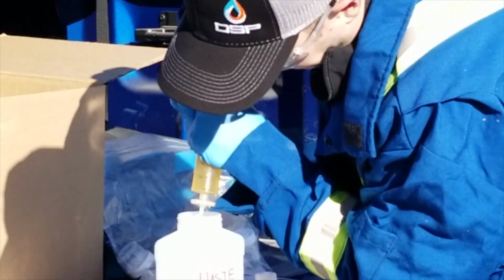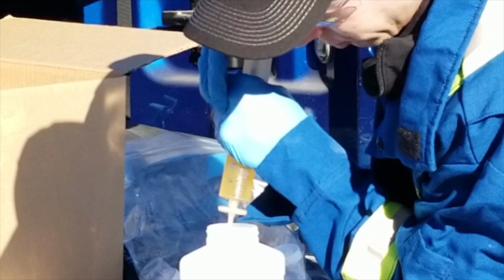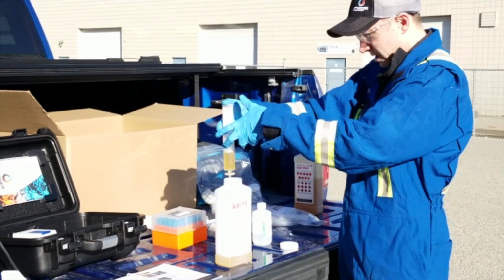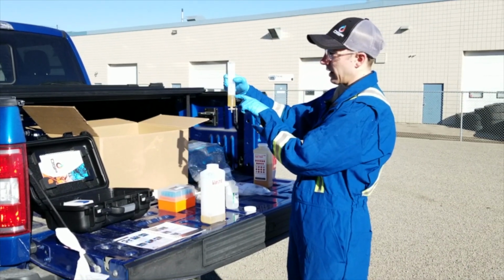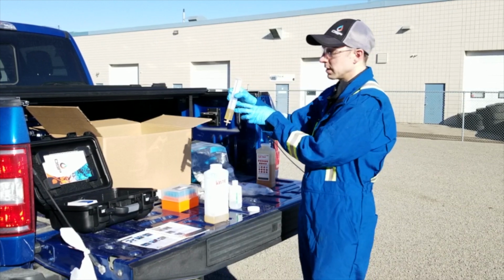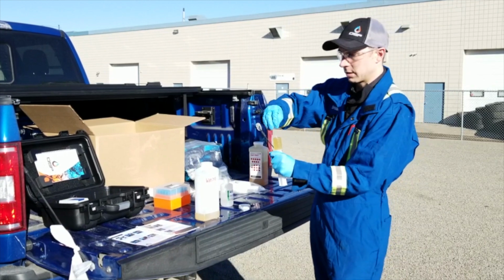So just push as much as you can. You want to get at least 1 milliliter through the filter. More is better, but 1 is okay. Once you can't push anymore, you want to read what this level is now at, which is 30 mils. We started at 50, so we filtered 20 mils, which is our sample volume. We need that number for calculations later on.